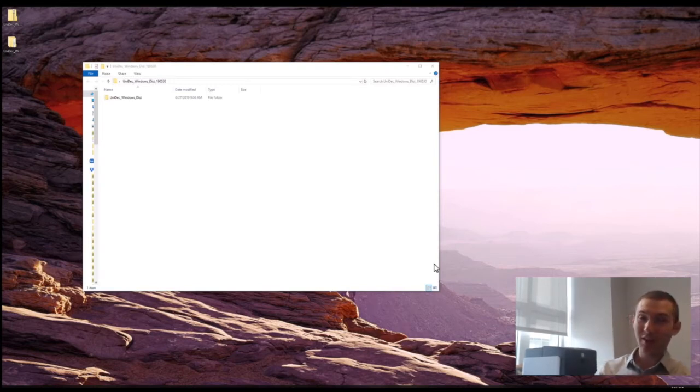And also, I think it provides a pretty friendly way to get your data out, to do various sorts of data analyses, to extract information on mass, charge, intensity, all of these things. Over time, we're going to be doing more of these tutorials, but today we're just going to give a very quick intro to how you use the software, how to get started, and some very basic parameters.